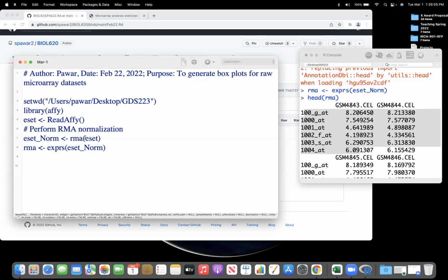Okay, so I don't think you ran the previous statement. Run line number 6. Okay, now after this you run line number 7. That should work. Take some time. Wait.